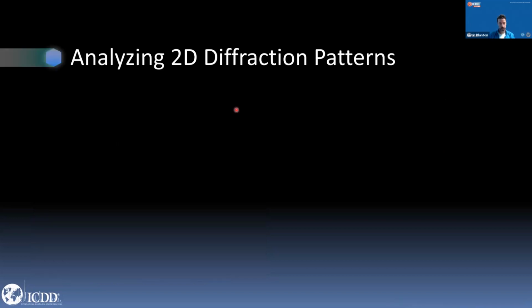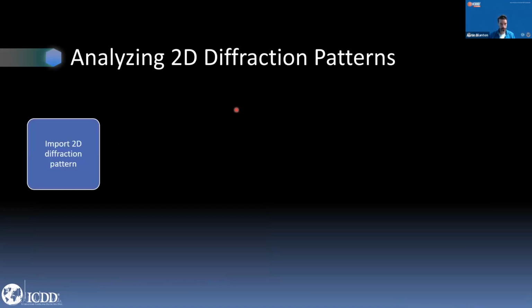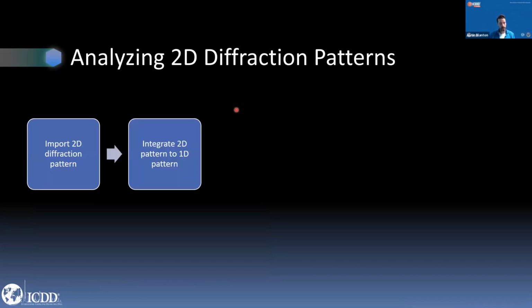All right, so I'm going to show you how to analyze the 2D diffraction patterns. But first, I just want to explain, again, if you're not familiar with 2D diffraction patterns, how you essentially analyze those in the PDF database. So the first thing you would do is you import your 2D diffraction pattern. Now, here is the key difference. We integrate the 2D pattern down to a 1D pattern.